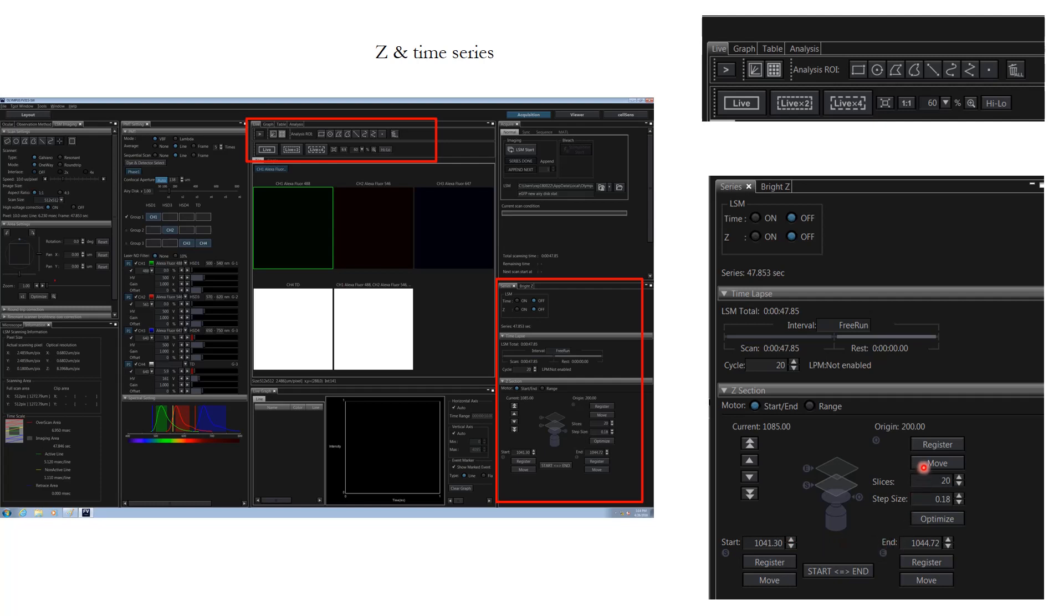If you want to see how many slices are going to be there, this will be auto filled anyway based upon the step size. You can click optimize here to do the Nyquist sampling again. That way you do not have to worry whether you are going to miss out any object or under sample or over sample. Olympus guys have done a good job here.